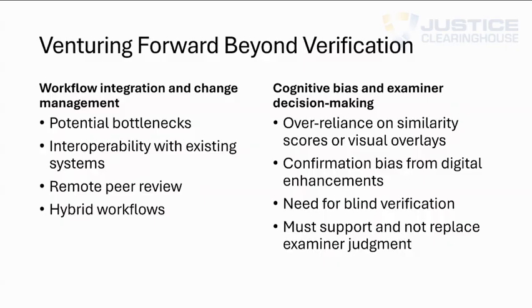Throughout the history of machine-based work and machine-based studies, and I've looked at a lot of them, there has been a significant overlap in which same source samples score really low among the data sets for the known different samples. And when we have pulled those images up, we can find enough support and enough correspondence for an identification.